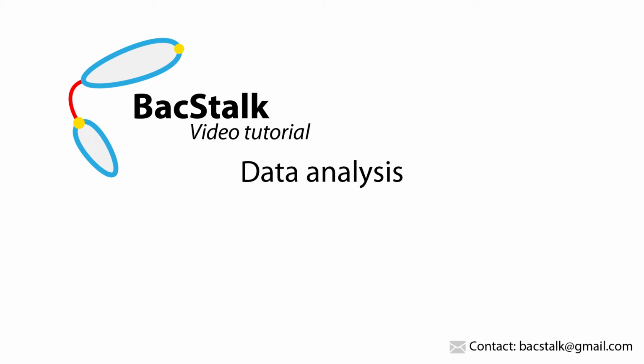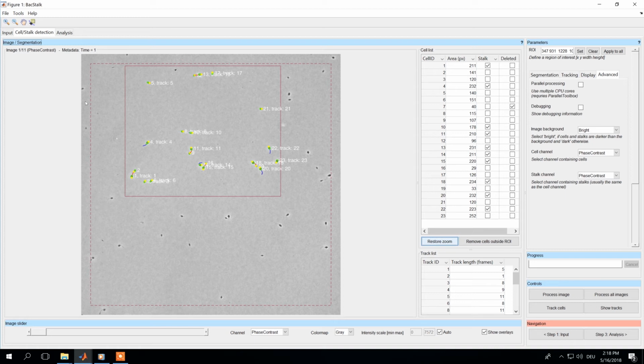Welcome to the third tutorial of BacStalk, where we would like to show you which data analysis capabilities BacStalk has. After the first two tutorials, in which we've shown importing images and assigning metadata, and cell and stalk detection, we would now like to go on to the analysis panel. One can either do this here in the tab, or down here, step 3 analysis.